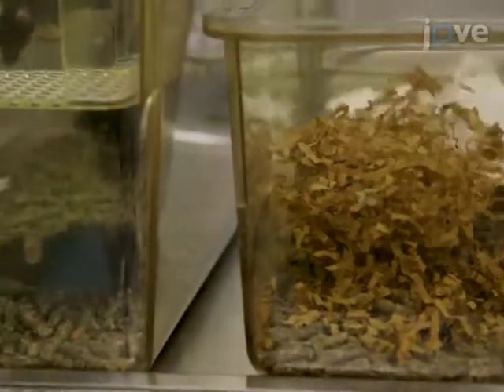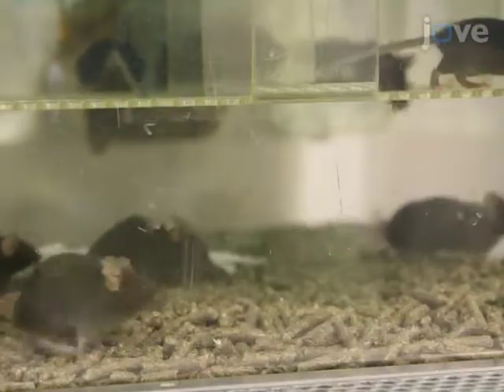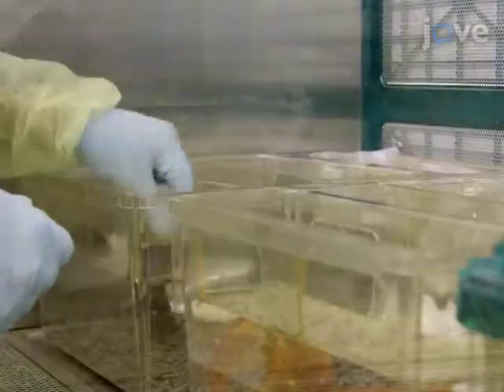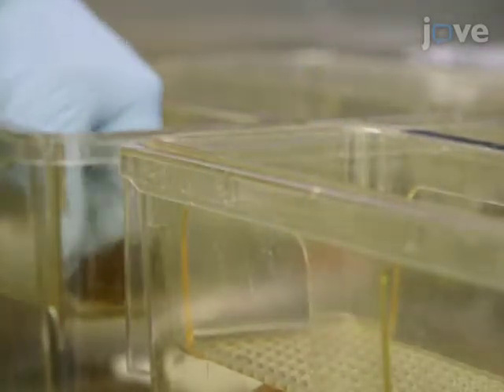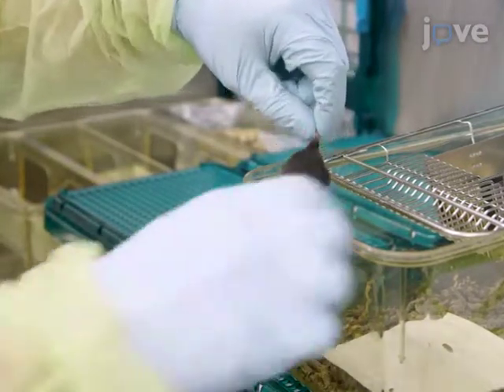Up to 12 pregnant dams can be housed in the environmentally enriched cages with platforms, provided they are all expected to deliver during the same week. When the pups are 21 to 28 days old, distribute the males and females by genotype into control environments or enriched environments. Make sure to keep an equal proportion of each genotype in each cage.